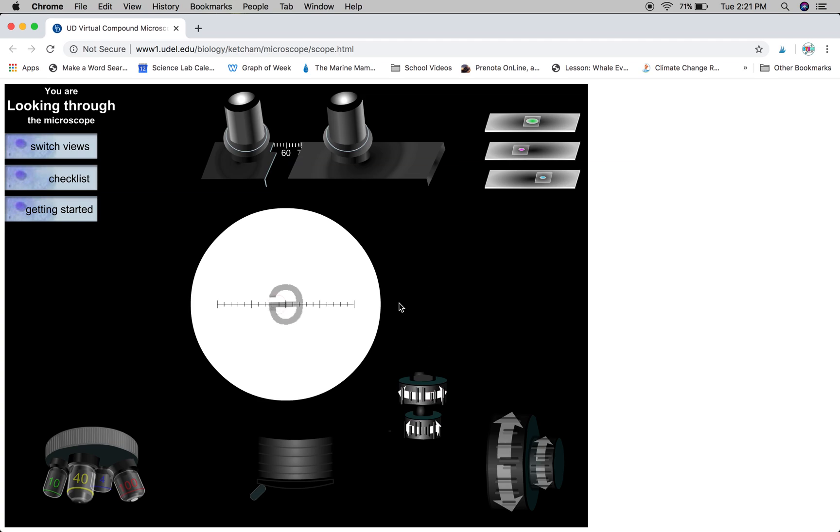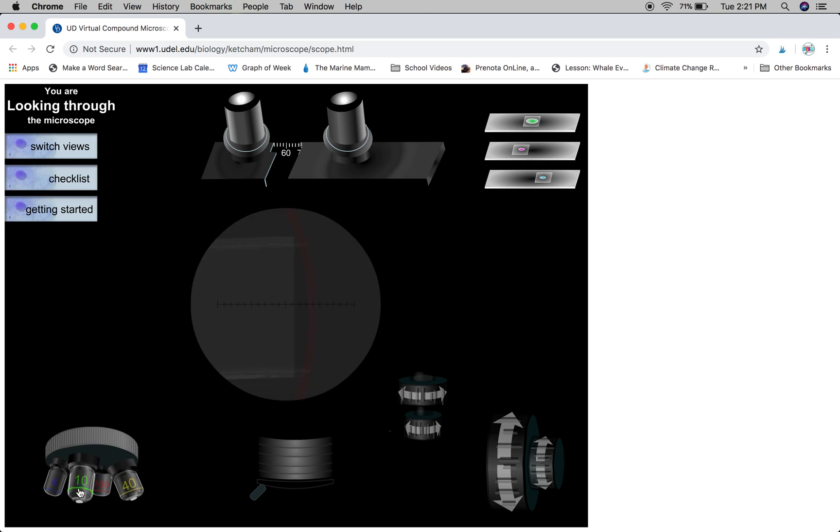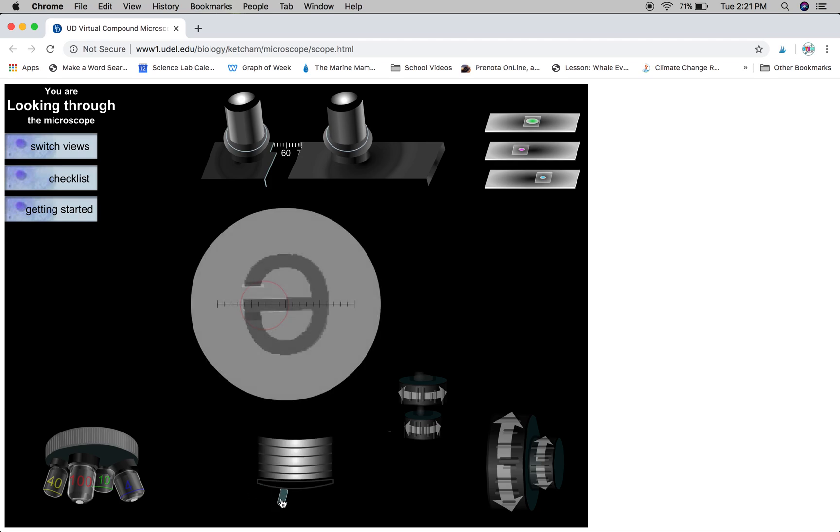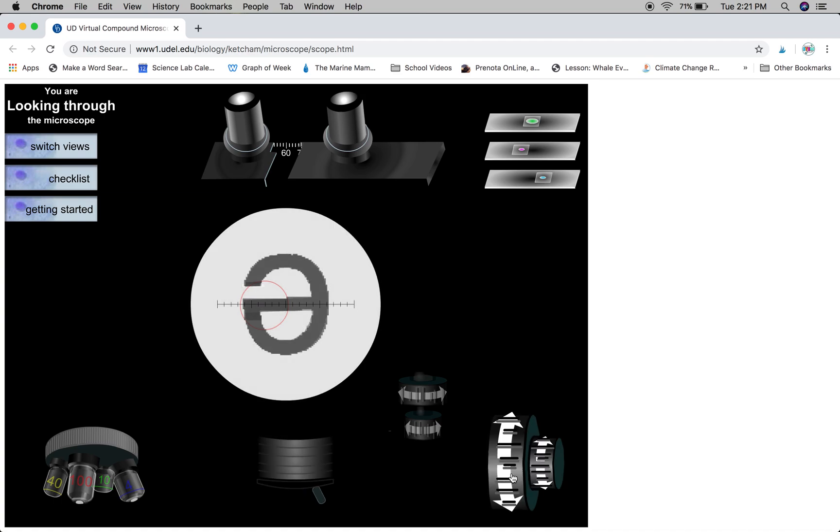Once we have it right in the center of our field of view, we're going to adjust the objective lenses going up to the next one. You can see once we've done that we don't have a lot of light. Our image is dark, so we can adjust the diaphragm and we can also adjust our fine focus to really fine-tune our focus.